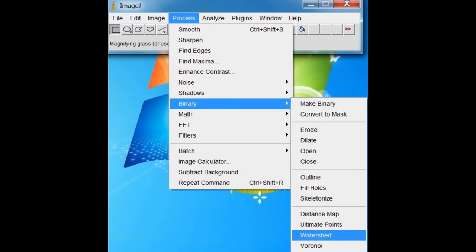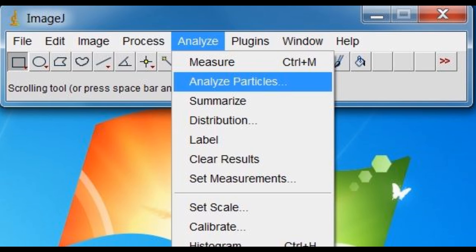If there are objects in your image that are overlapping a little, they may be separated by selecting Process, Binary, then Watershed. With the image now binary and a scale set, ImageJ is now able to analyze the particles in the image.